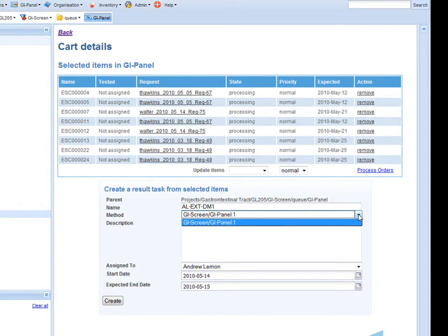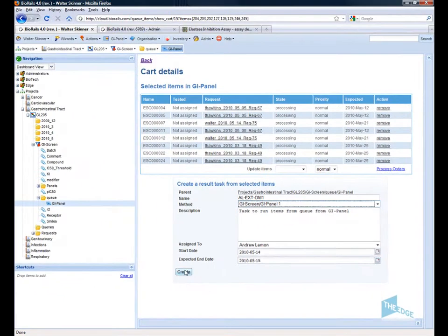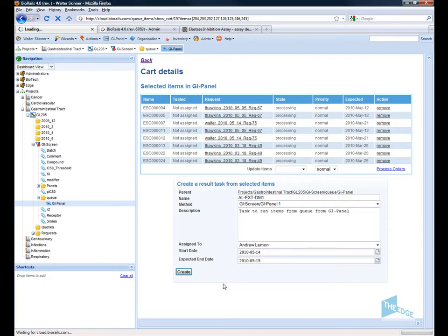Select the method I am going to run. In this case it is the GI panel process. Select the expected end date and then create the work package.